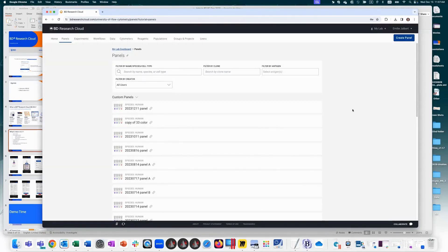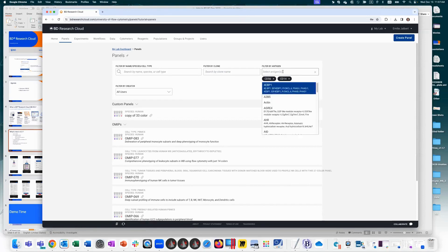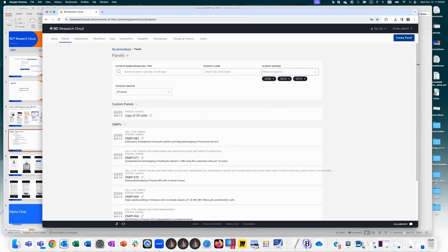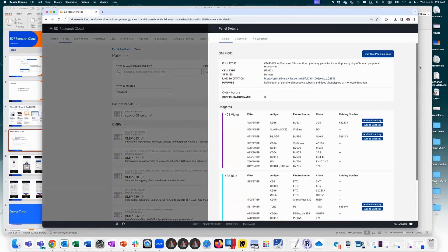If you want to search for panels, you can type in antigens — for example, CD14, CD19 — and the list filters to show only panels containing those specific markers. You can click on them to see if any suit your need. We show the panel as entered, with citation links for OMIPs. You can use a panel as-is, as a base to modify for compatibility with your cytometer, or make simple swaps or deletions from these prebuilt panels.